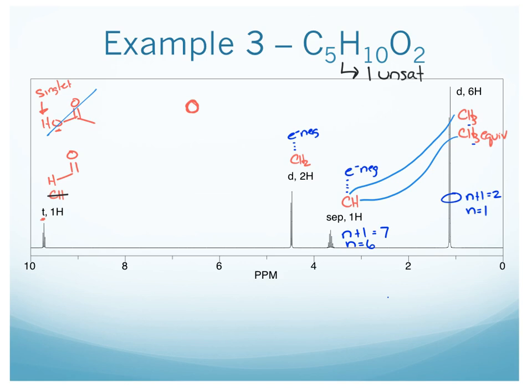So that can't be connected to any other CH carbons. But we actually want to make a connection to an electronegative atom because of our note. And what do we have? We have this oxygen that wants to make 2 bonds. So let's connect that. Well, we can give the oxygen its second bond by connecting it to this CH2. And then all that's left that needs connection, we have the aldehyde carbon and this CH2 carbon that only has 3 bonds right now.